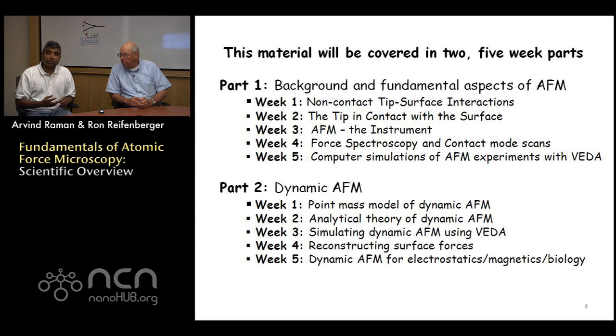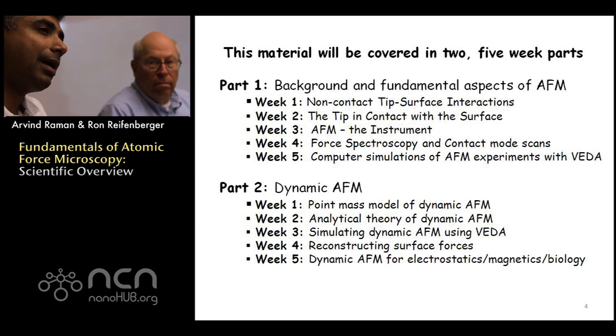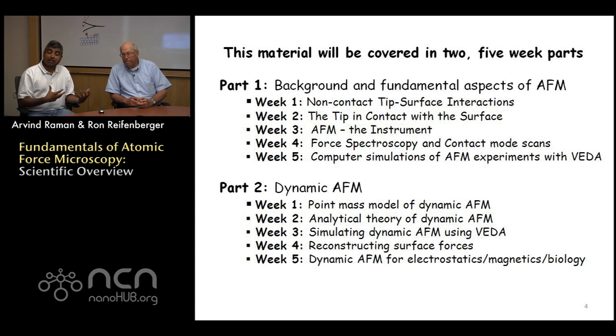We will, of course, also be looking at different ways of doing dynamic atomic force microscopy, which include, for example, tapping mode or amplitude modulation AFM, FM AFM, and phase modulation AFM. So we'll be covering those aspects as well, and we'll also be dealing with how these observables in dynamic atomic force microscopy can actually be used to generate quantitative estimates of local properties through a process called force reconstruction.